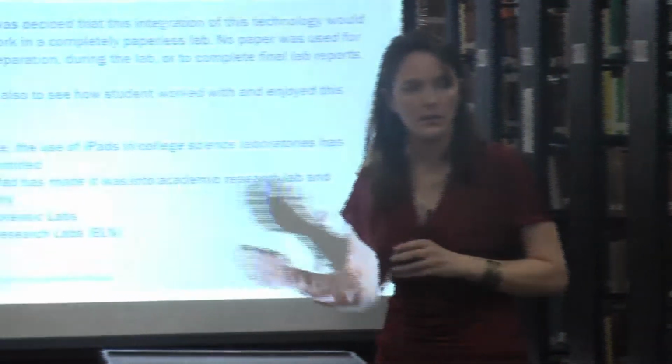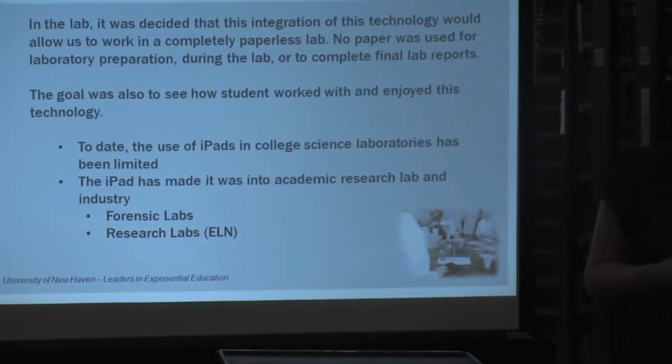It's made its way into forensics labs. Harris County Forensics used 20 iPads and dispersed them as a pilot program throughout the area to see if they could work those electronic notebooks into the labs. Research labs also use electronic notebooks, the ELN, that's what that stands for. And that's been done for quite a while, except they've really been used in computers. So there's been programs out there like Agilent Software and Cambridge that have been taking computers and making programs for laptop computers for record keeping.